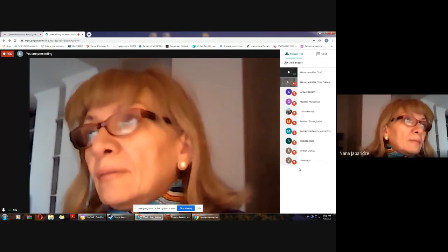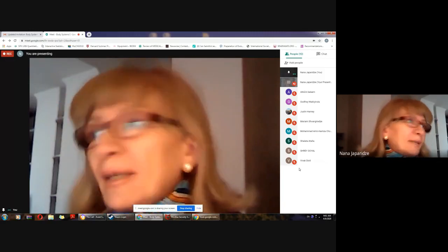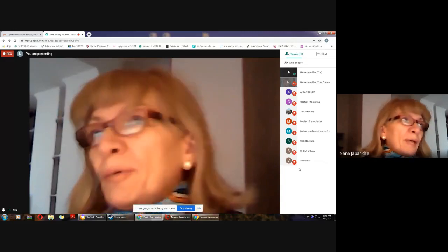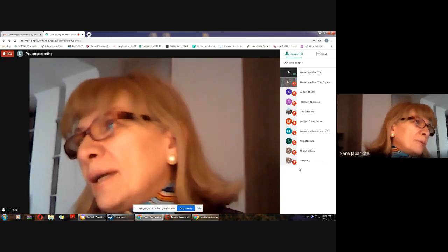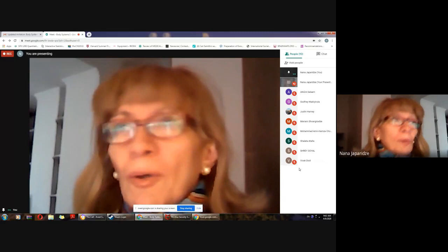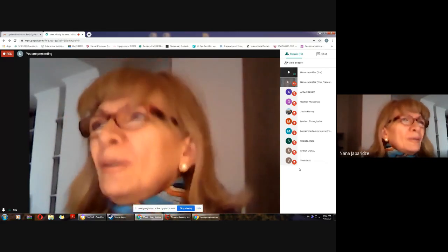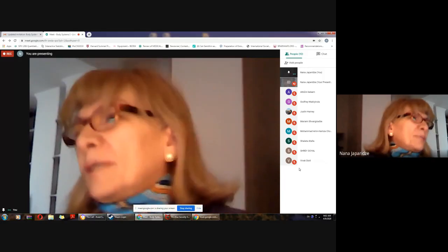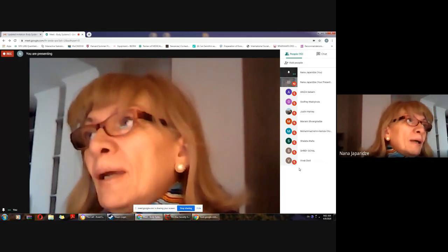So usually, in our normal routine, we work in the e-classes at the university where we have light microscopes and tissue samples, and we have the possibility to see with our own eyes what happens in light microscopy. Hopefully, you have seen light microscopy and even have some small experience working with it.